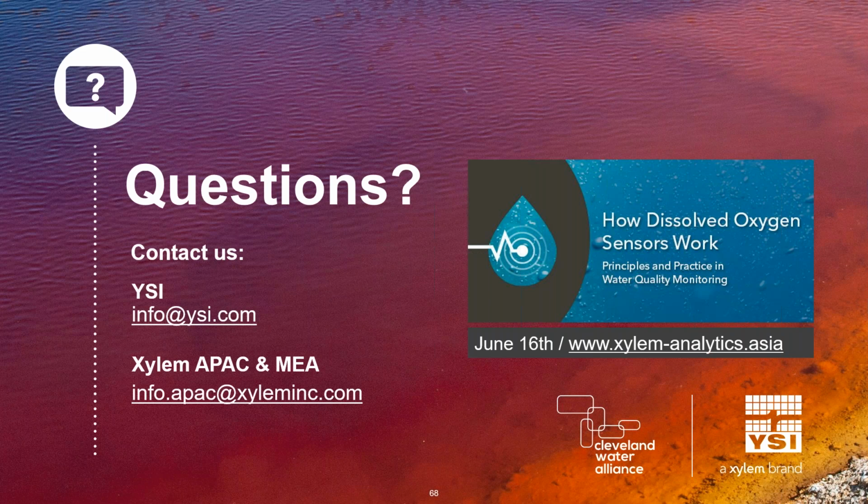I really like refillable ones because I work in labs often. You can put more solution in once it's outflowed to the point where it's gone too low. It arguably lasts slightly longer because you can keep on putting in more solution. So my short answer would be, for most environmental applications, gel filled is my preference. And for most lab applications, refillable is my preference. But both should work in a lab environment.